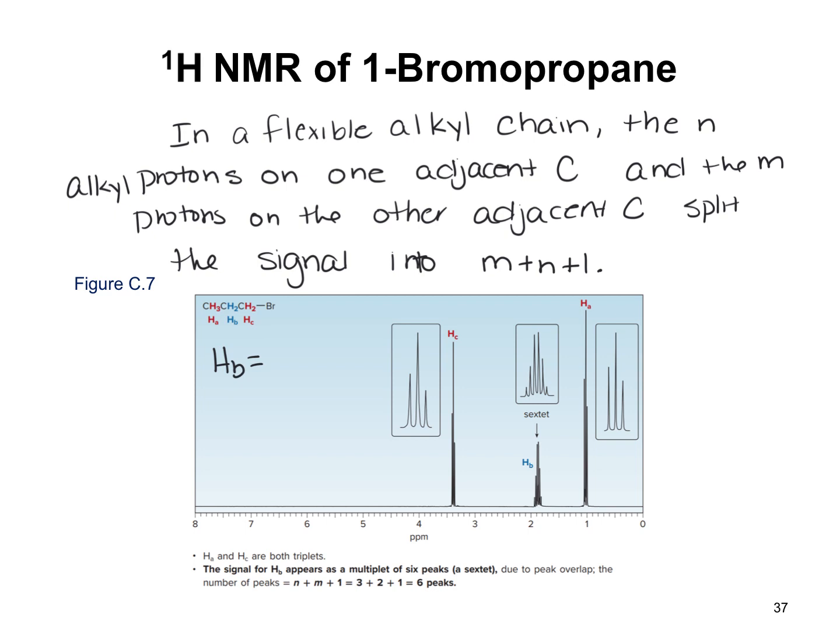So what we would do then is say, okay, N plus M plus 1. So 2 plus 3 plus 1, we would expect that to be a sextet with 6 peaks, and it is, right? And so with long chains, this is what we see. It follows that same pattern.